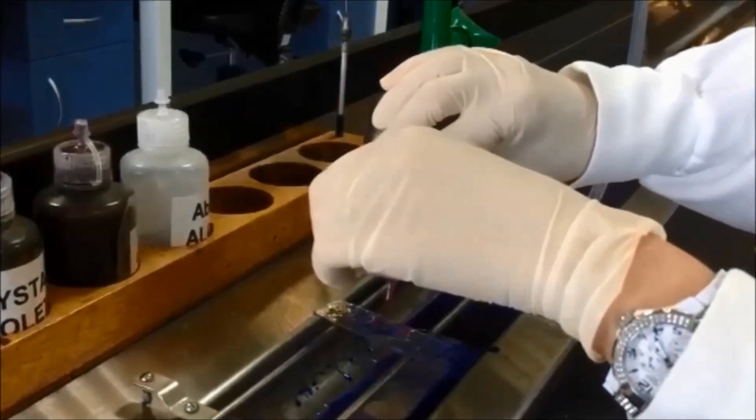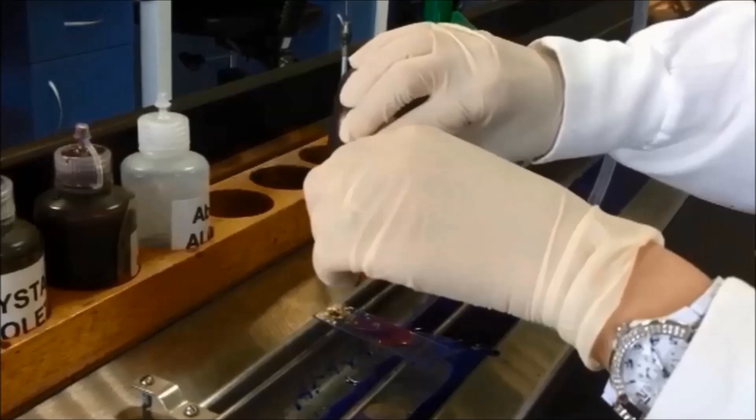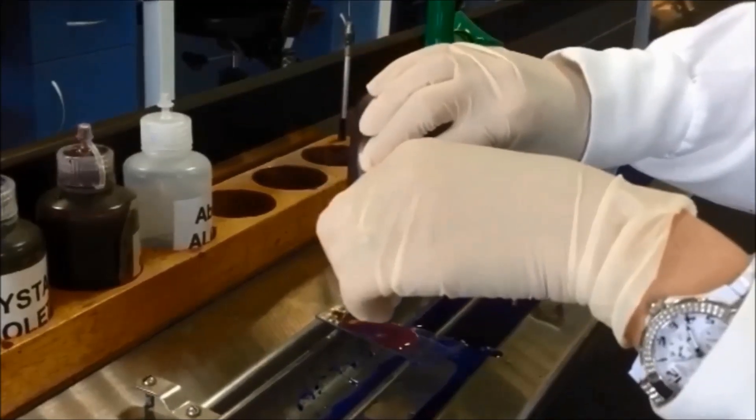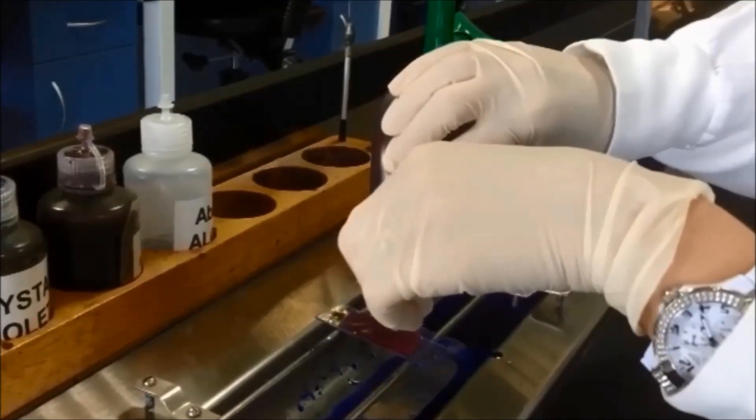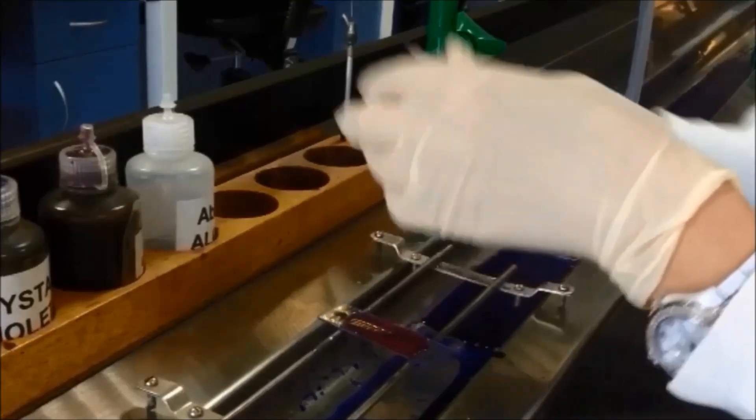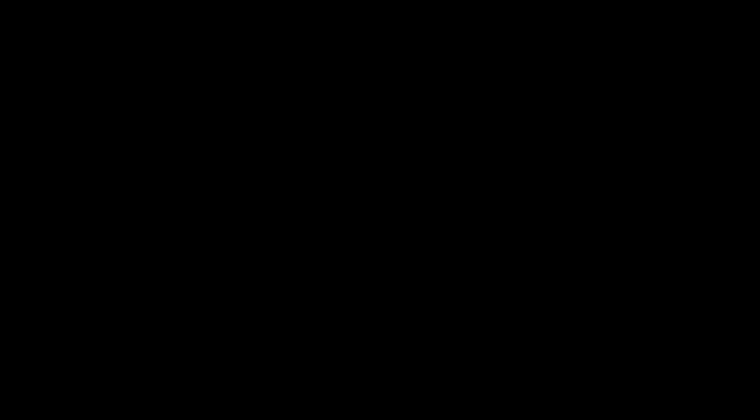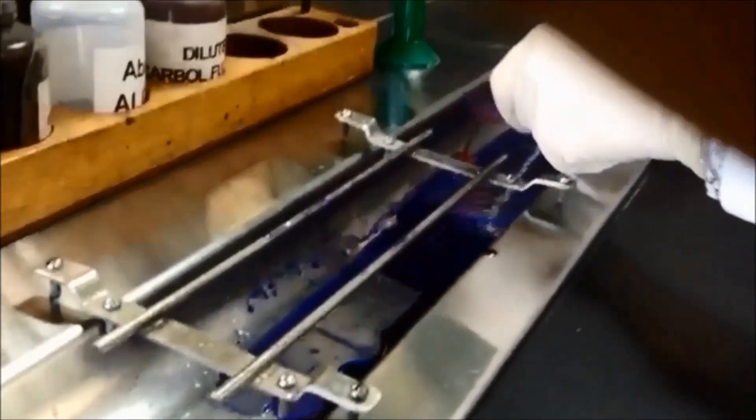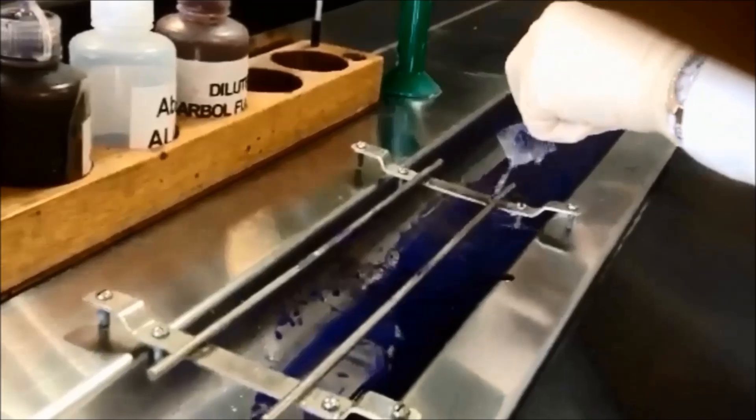Counter-stain by flooding the slide with Dilute Carbolfuchsin for 30 seconds. Once again, wash with water.